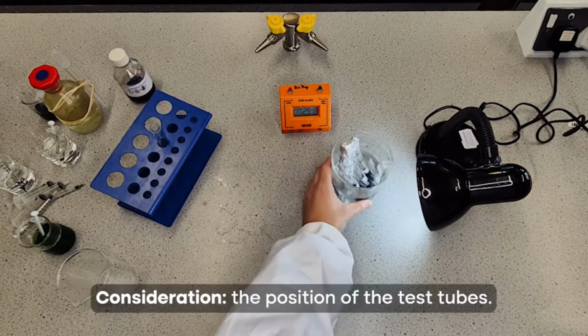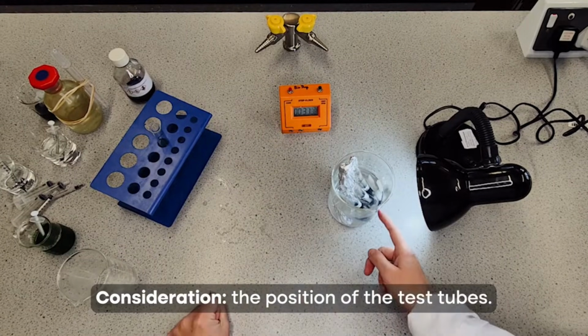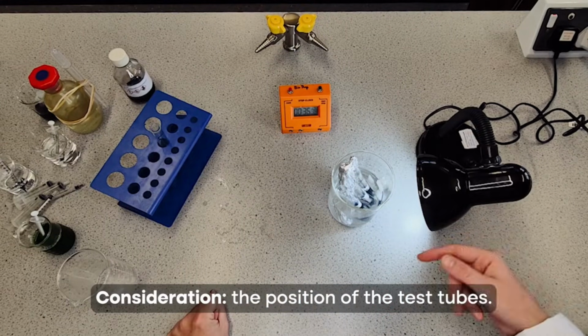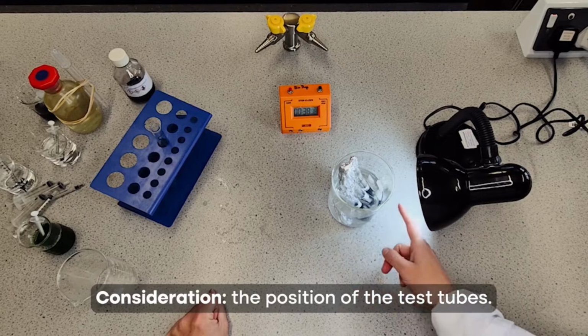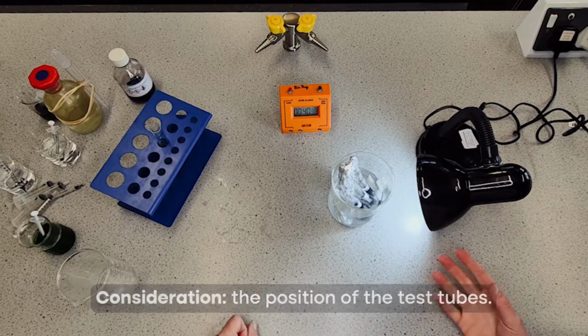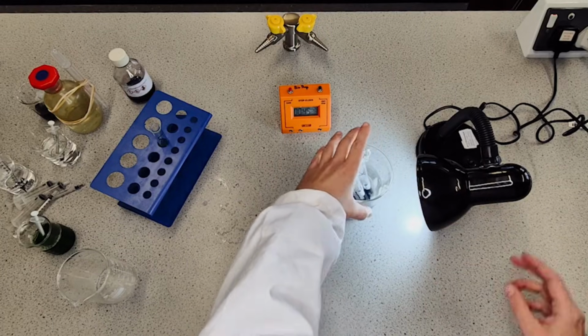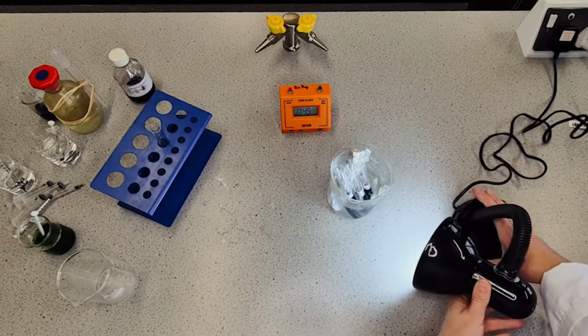One consideration you could get the students to think about as well is the position of these test tubes, because I've only got a light source here on one side. So are they all receiving the same light intensity? So that's one consideration. They've got multiple lamps, they could position it. I'm going to try and position it here so they are all receiving the same amount of light energy.